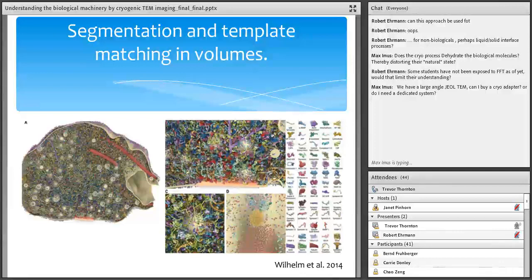And so this is really where we're headed in the future, and there's a lot of push now to figure out how we're going to do that. Do we need low resolution frequencies or do we need high resolution frequencies? There's a lot of push now that the high resolution information helps us deconvolve the fact we have a bunch of molecules on top of one another, touching one another.